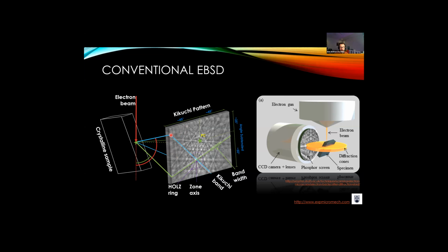Each of these diffracting lattice planes intersect at a zone axis, which is a crystal direction. One of the nice things about this is that the EBSD technique is done in direct space, and that can be helpful for various bits and pieces. We have some geometry that's important.